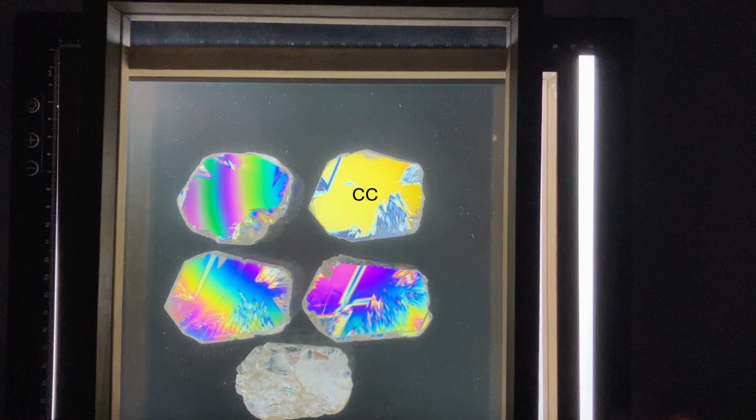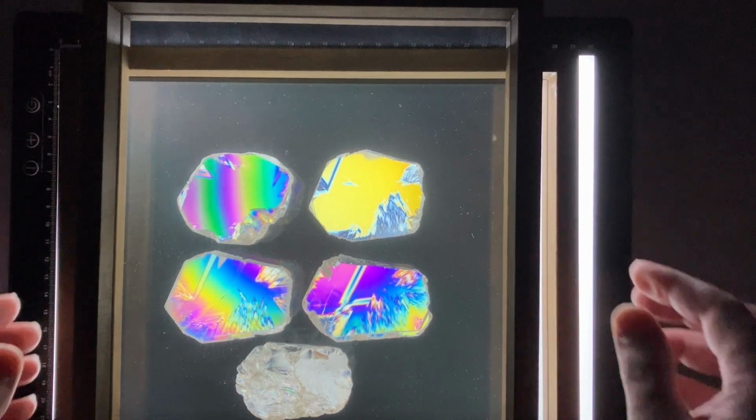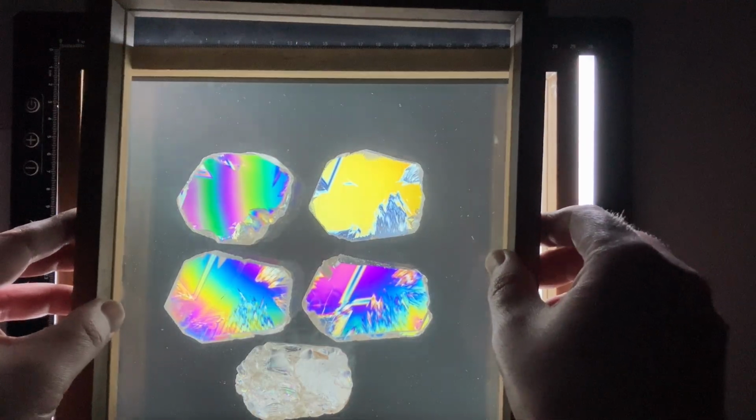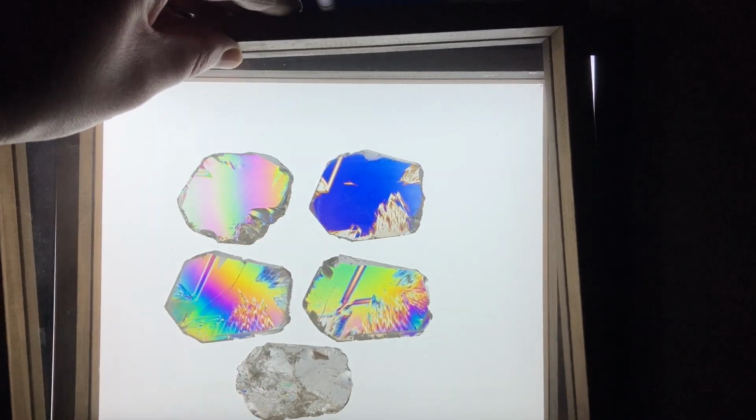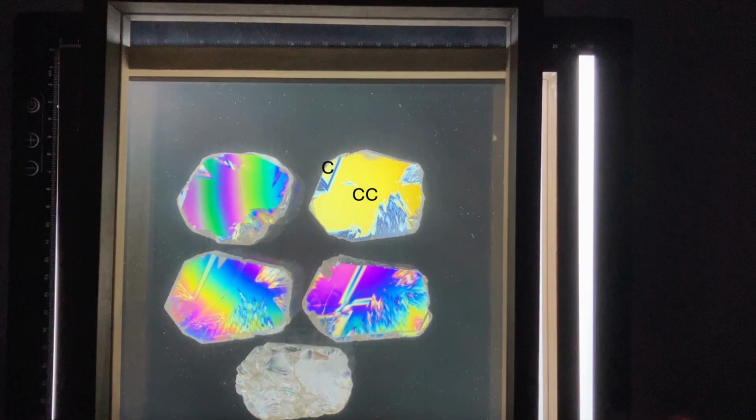The Brazil Law twins are where we have a mix of clockwise and counterclockwise, but there's also one little segment in the upper left portion of this crystal slice where those spiral staircases are rotating clockwise. If you're looking at that upper left portion, as we rotate our upper polarizer, you'll notice the crystal goes from yellow to green to blue to finally violet. So that tiny segment of our crystal has our spiral staircases rotating in a clockwise direction, and we can continue to do this exercise for all of our crystal slices.